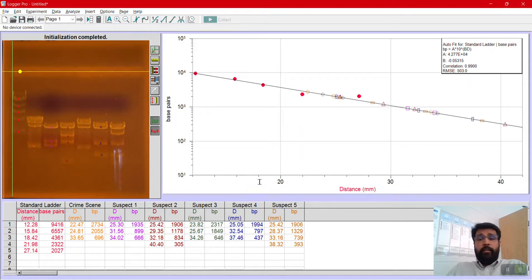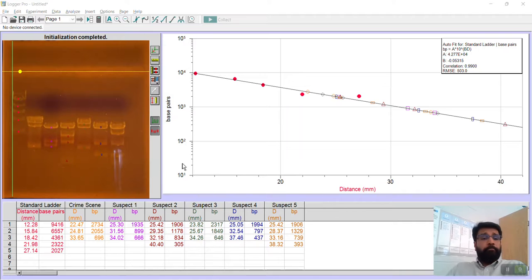I hope this video is helpful, and please make sure you do this analysis and complete the lab report. And so if you're using digital lab report in the poster method, you can use this file and then save it as PDF and send it to yourself and take the screenshots of these different locations like a gel or the graph or the data and whatever you want, and so you can use it appropriately in your data table as well.